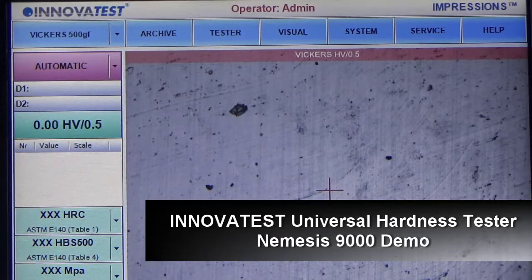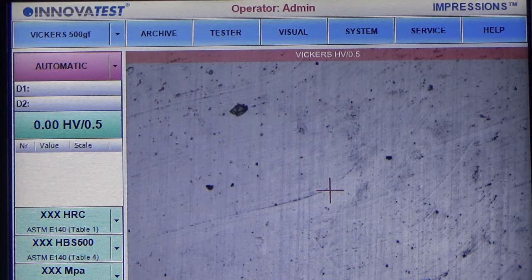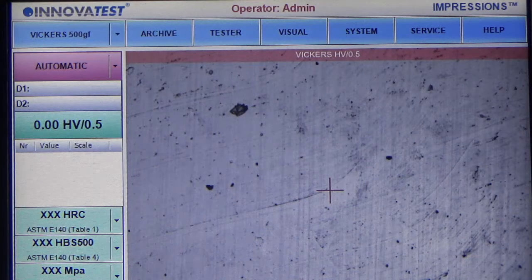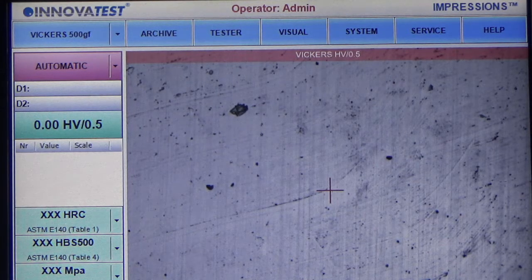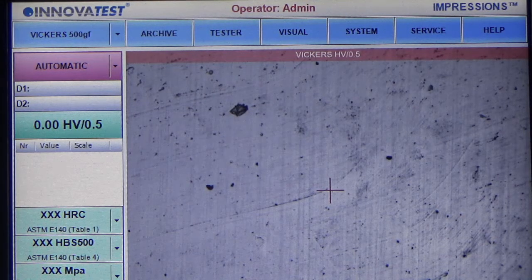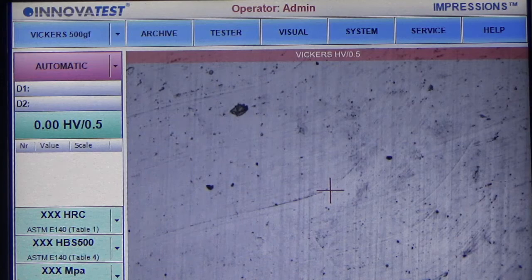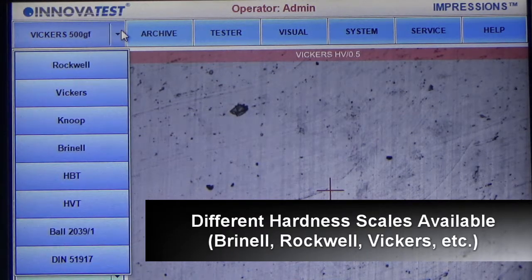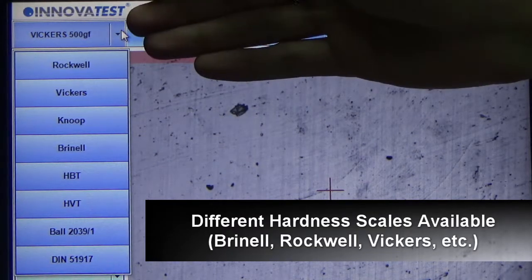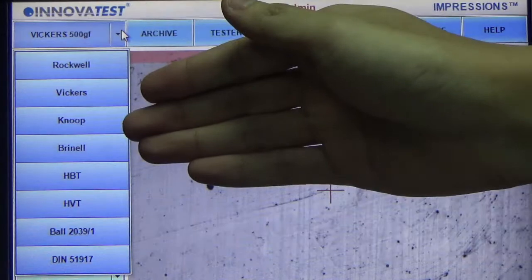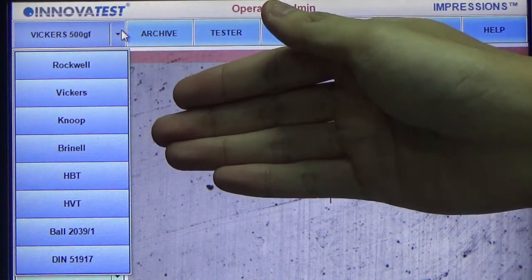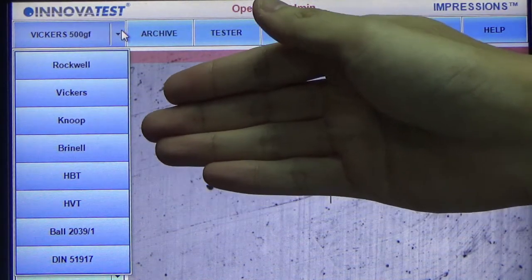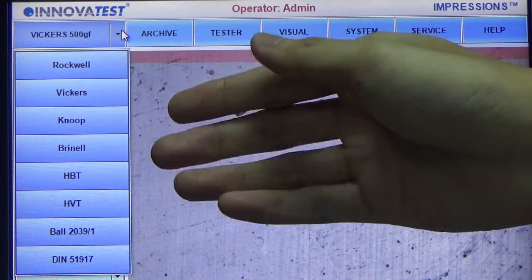Hi everyone. Today we have this Nemesis 9000 universal hardness tester from InnovaTest. As you can see, there's all the Rockwell, Vickers, and Brinell scales available as it is a universal hardness tester.